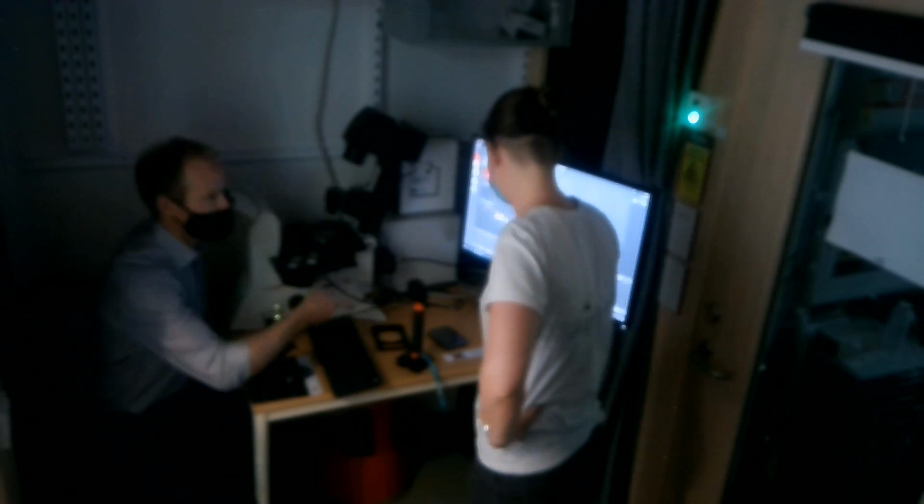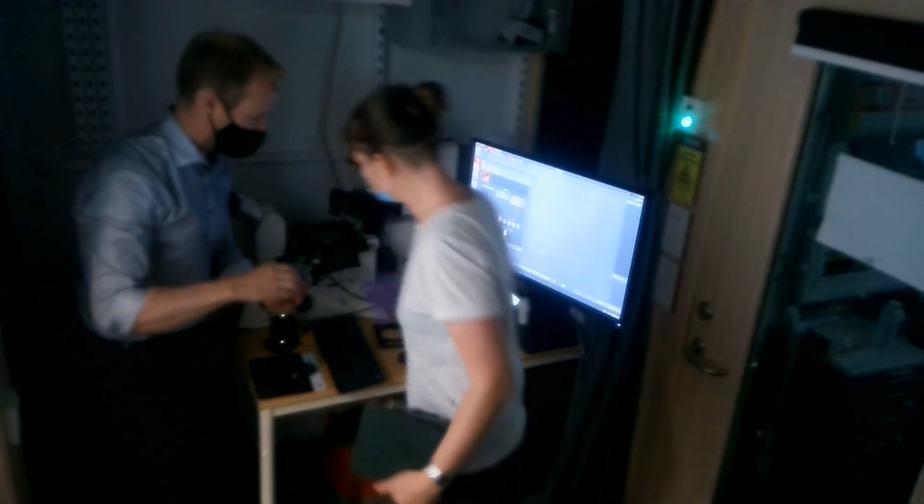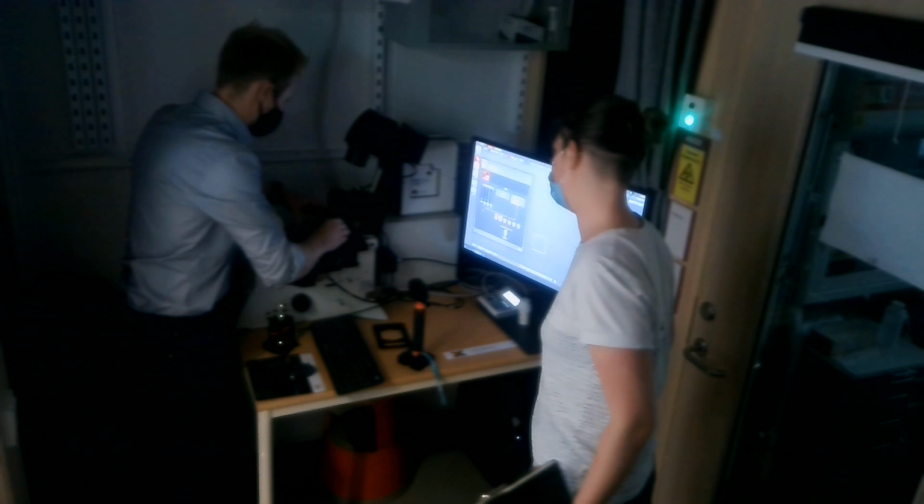So I will start a little bit, and then we'll hand it over. So where do you have your sample? It's basically here in this area. Okay. So A1, 2, B3.